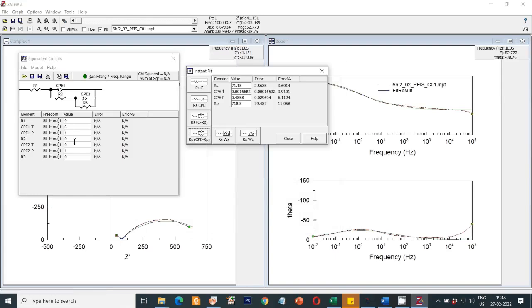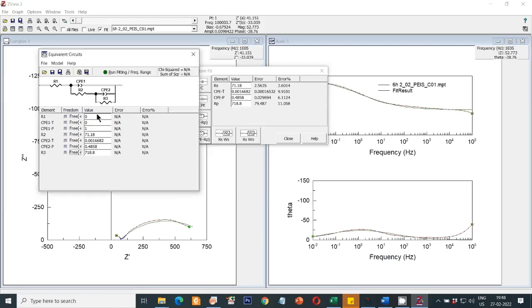For the second loop, take the values from the instant fitting option — simply click and drag so the values will be copied from instant fitting to advanced fitting. For the R1 and CPE values of the first loop, you have to input values manually. I'll put 0.0004 and 1.9, then click on the Run Fitting option.